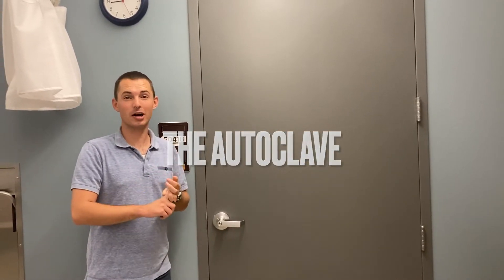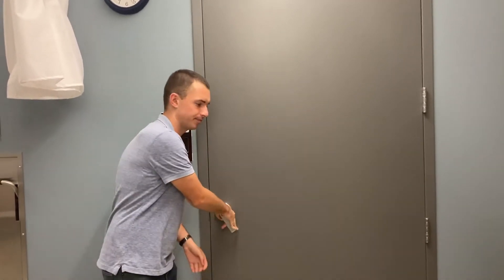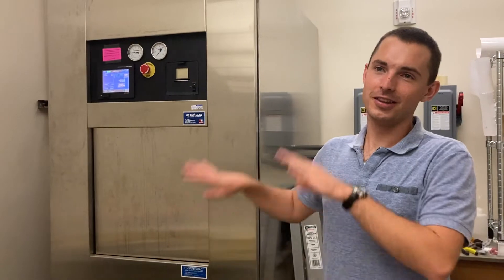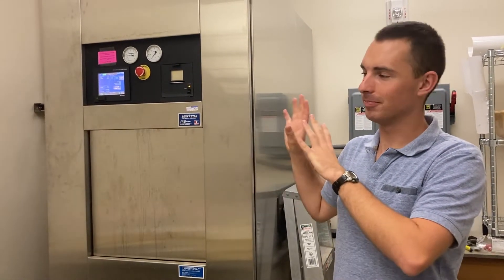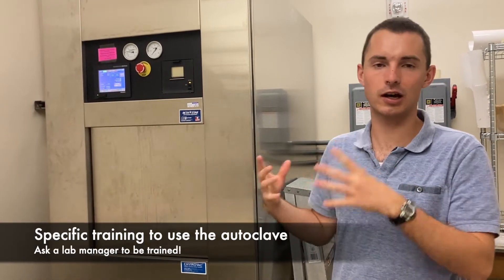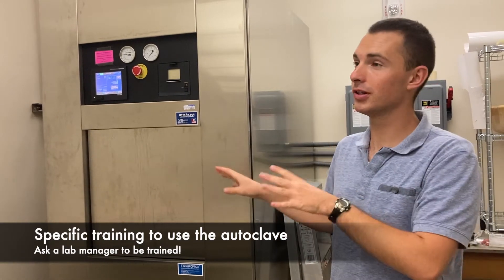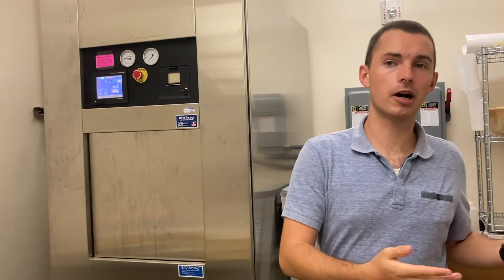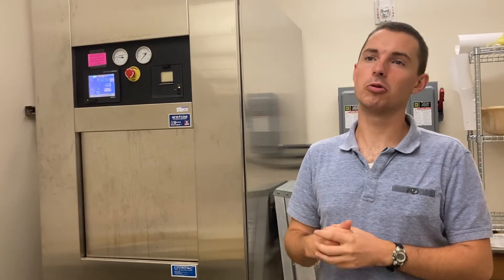In this room over here is something called the autoclave. It's a big, industrial, and extremely hot piece of equipment that we use to sterilize and disinfect some of our sampling bottles. This is a really dangerous instrument. There's a specific training on how to use an autoclave and how to clean autoclavables. Before you use this, you need to have that training — a manager or Ben will direct you to it. If you need something autoclaved, please talk to one of the managers or Ben.